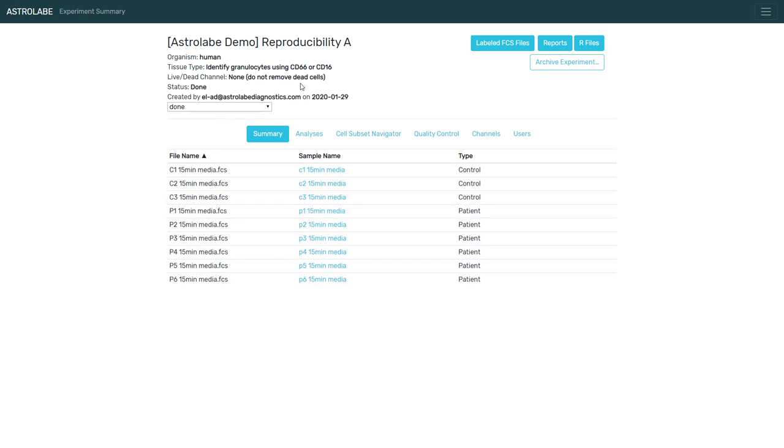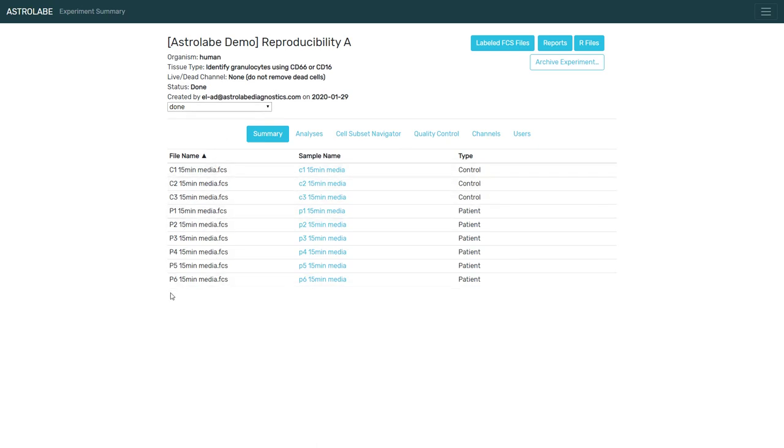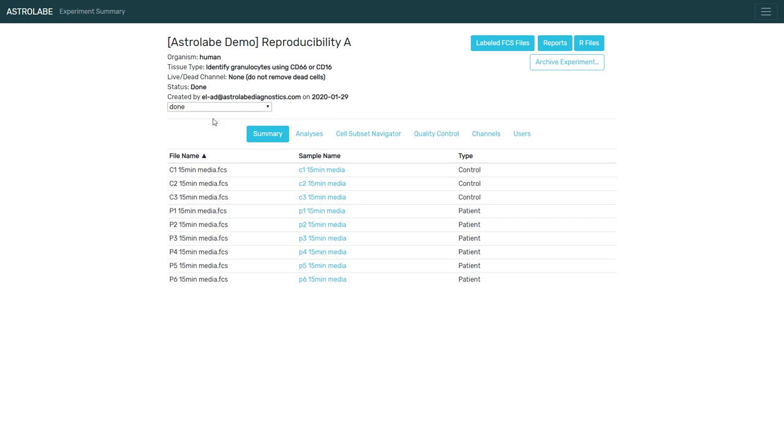And these come from Tordesillas et al. This is a peanut allergy study. So the controls are not peanut allergic, and the patients are. The experiment design is pretty complex. It involves stimulation with peanut extract. But I'm not showing you this here. I want to focus on the phenotyping.